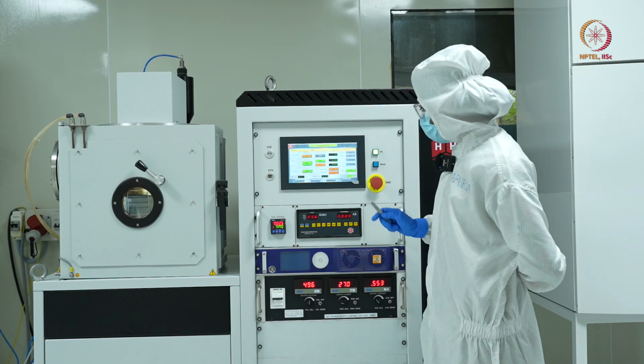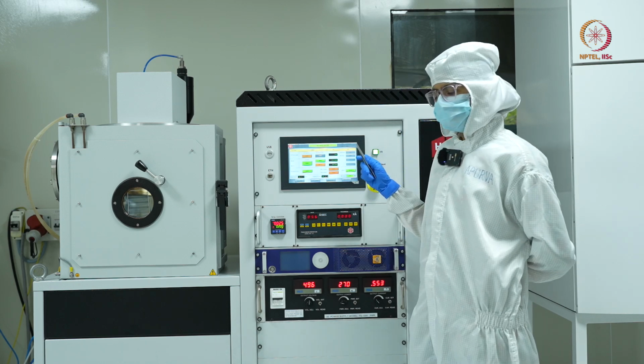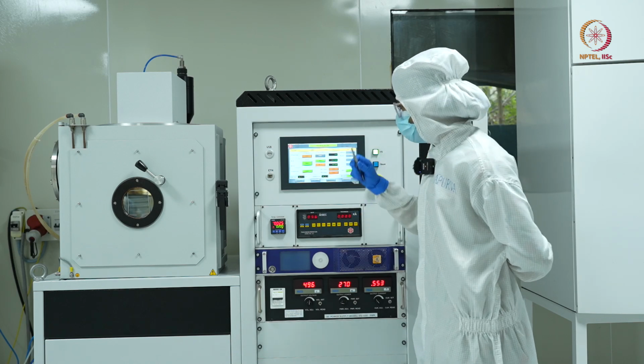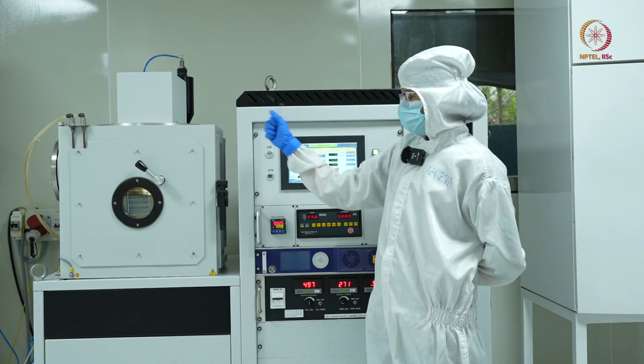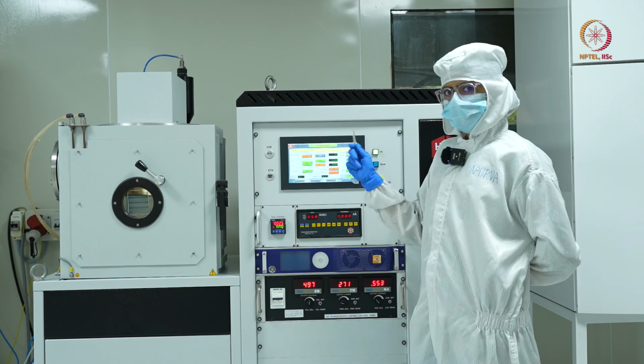Now it's time to open the shutter so that the deposition will start happening onto the substrate. Also, we need to rotate the substrate holder so as to get uniform deposition.